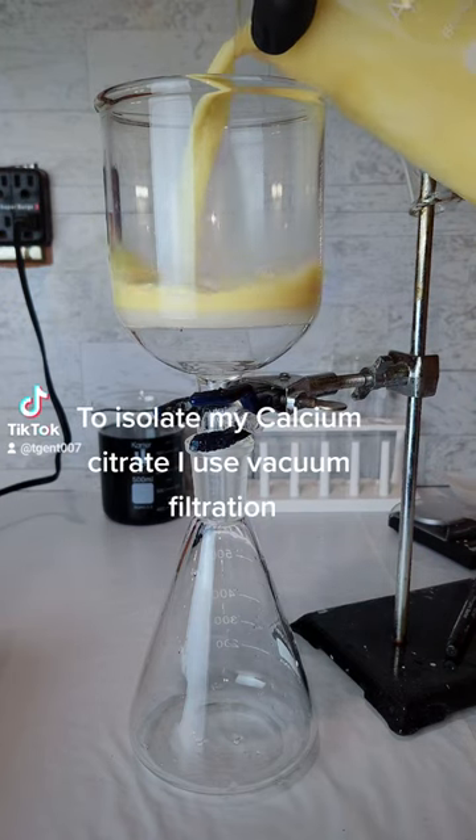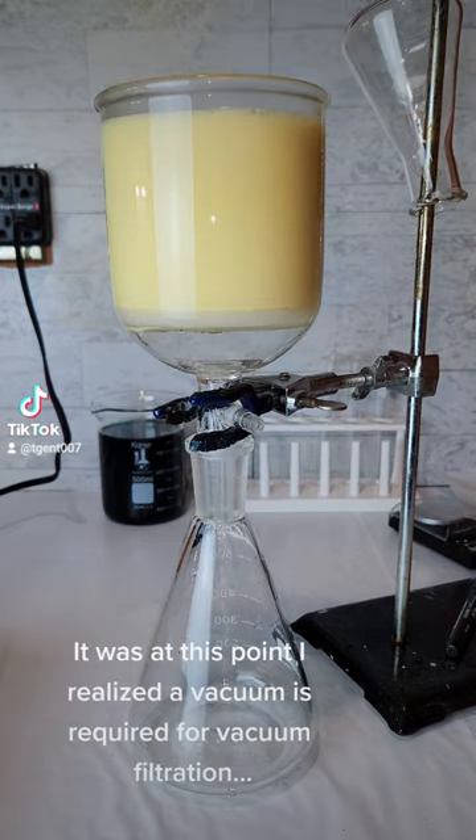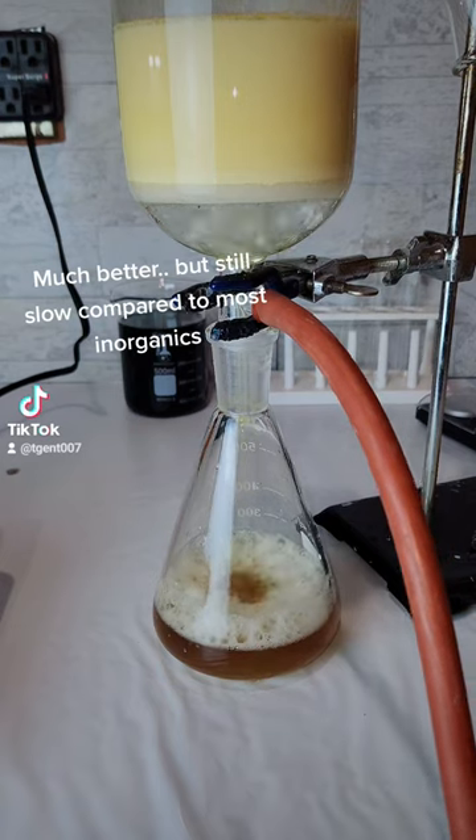To isolate my calcium citrate, I use vacuum filtration. It was at this point I realized a vacuum is required for vacuum filtration. Much better, but still slow compared to most inorganics.